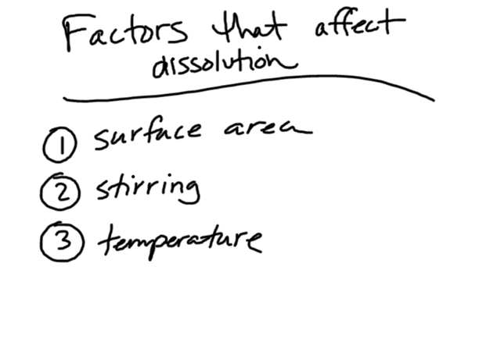Alright, this video is a pre-lab on the Dissolution Lab that you guys are doing in class. Mainly what we're going to be looking at is what are the factors that affect dissolution. The two main ones we're going to be looking at are surface area and temperature.